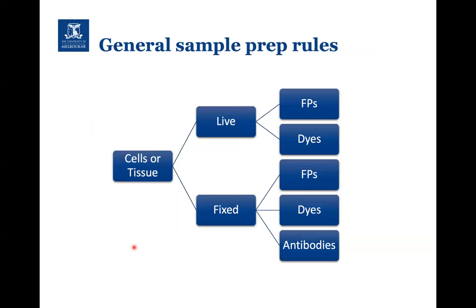Okay, so the reason I give general sample prep rules in this talk is because there are a million different ways that you can prepare samples. So it's very, very difficult to give one size fits all rules. This is your decision tree in terms of what you're doing for sample prep. So I would encourage you as much as possible to go down the live route. There's nothing better than acquiring data from a sample which is still living and still going about its semi-normal life if it's on a dish.